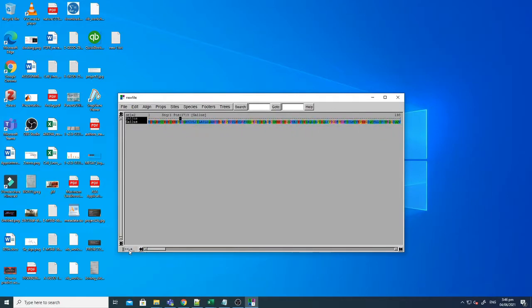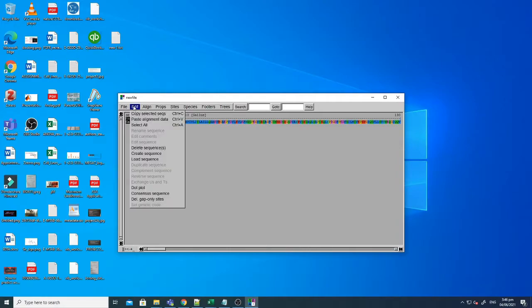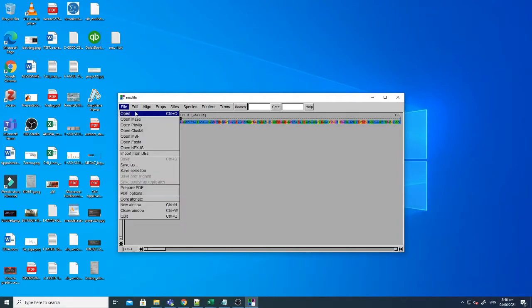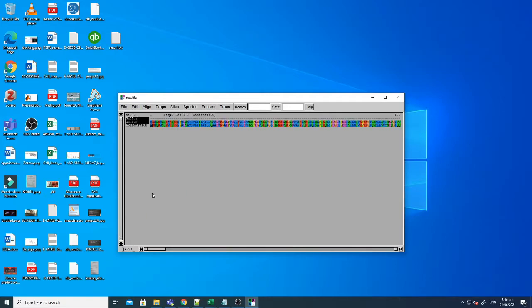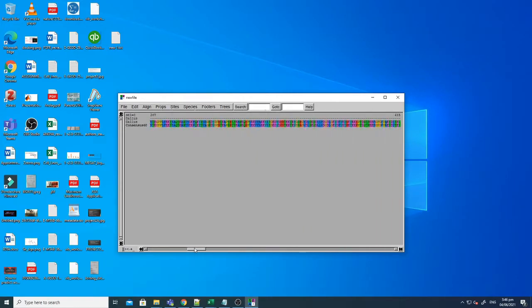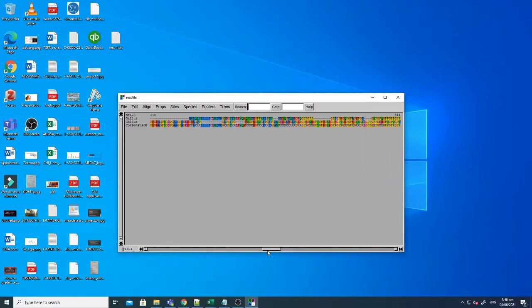And now for instance you want to build a consensus sequence of these two. Again you just have to select these two and then after selecting you just click the consensus sequence. And now this is the consensus sequence of the two sequences we used here.